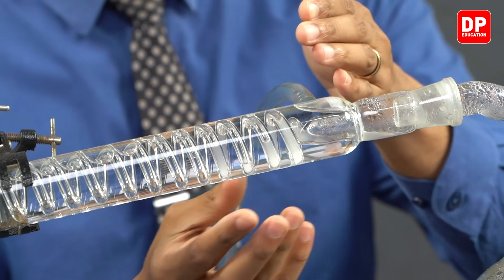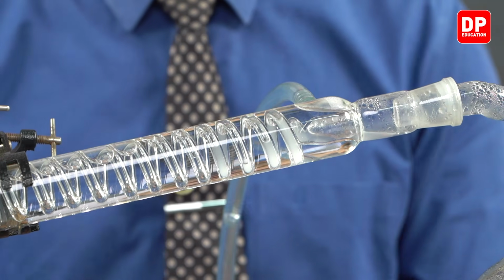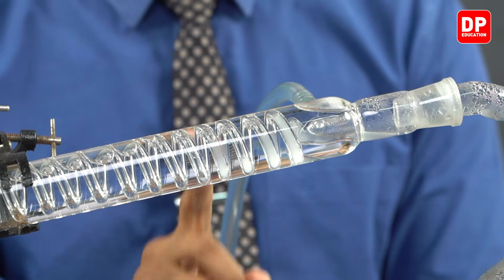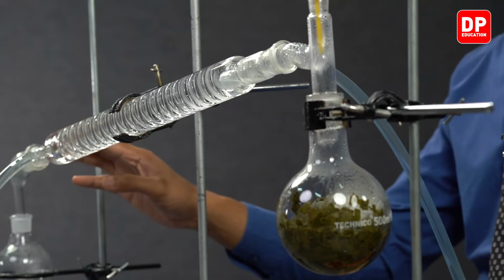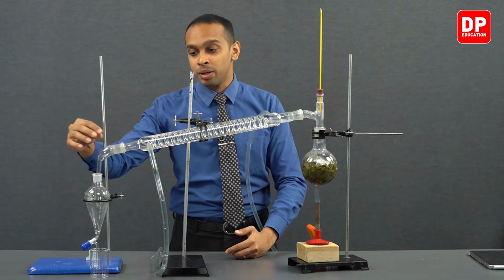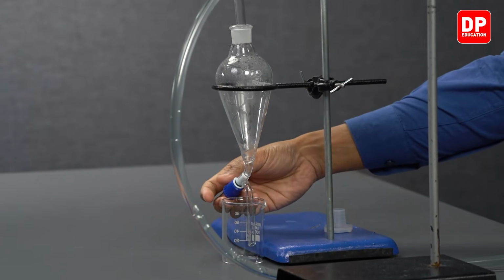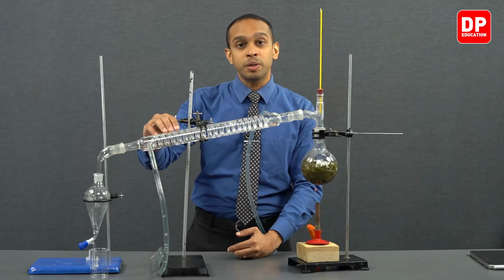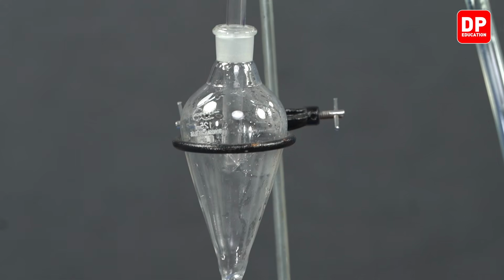So the vapor that is produced here will be directed into this condenser, and as the condenser cools down the vapor, it will turn into a liquid, as you can see here. And the liquid will slowly move to the bottom of the condenser and be poured out of the condenser into this separatory funnel. And we have made sure that the separatory funnel is tightly closed, so the liquid that is produced will get directly collected into our separatory funnel.